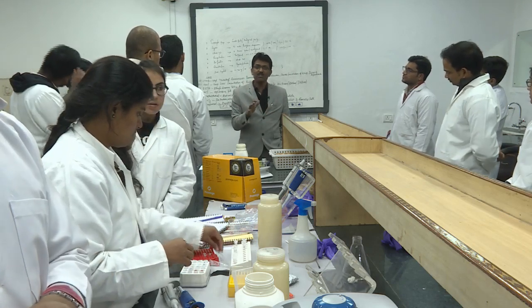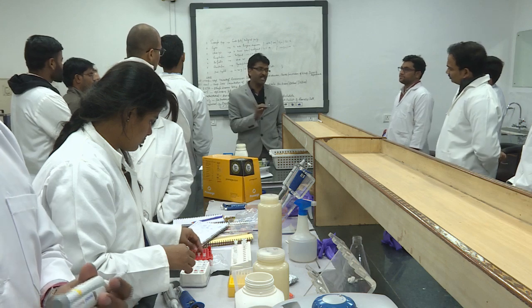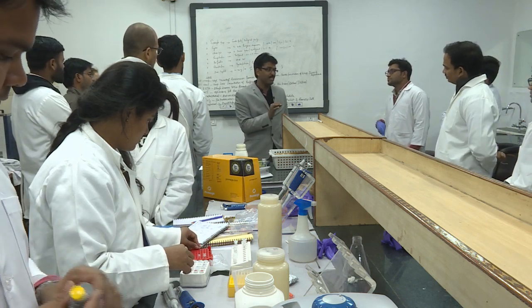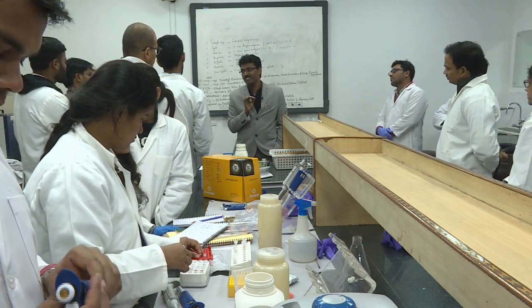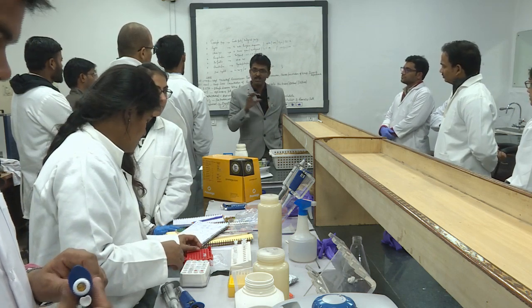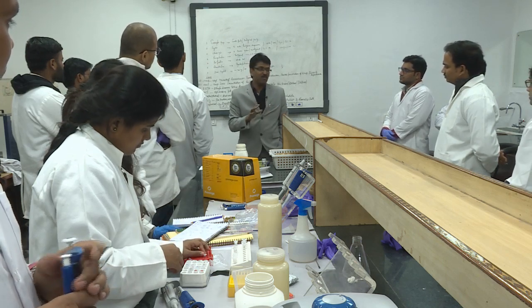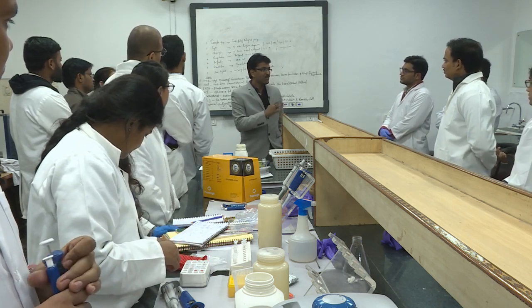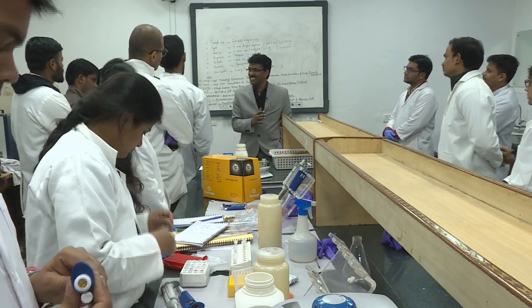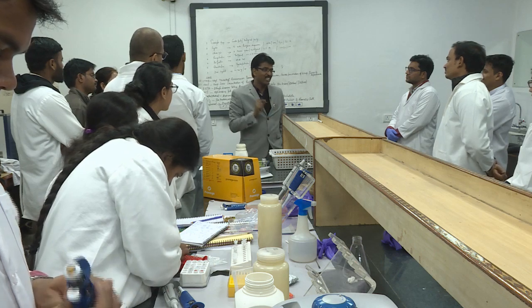So, the uniform start is the key to very successful DNA isolation. Never ever take an unknown quantity of biological material for DNA isolation. It is always a known quantity. Okay. So, do not ignore this sample preparation step. Many times we have the tendency, because you are always living with that fungus or bacteria, so you feel okay, I have the culture, I can take it. It is not like that, right.